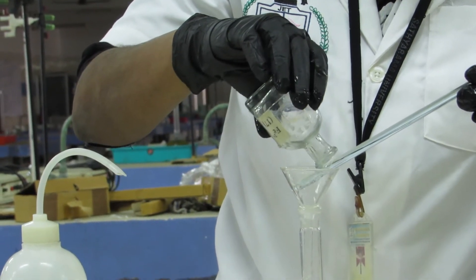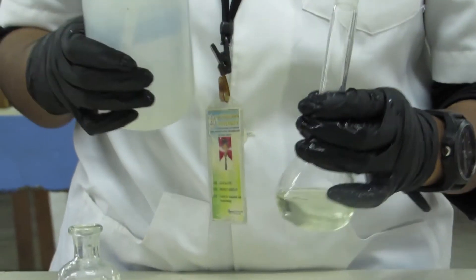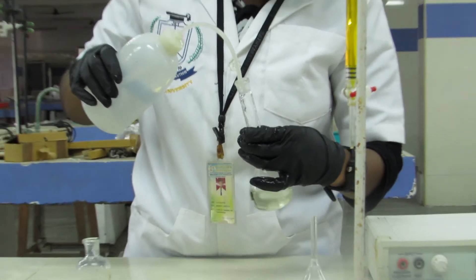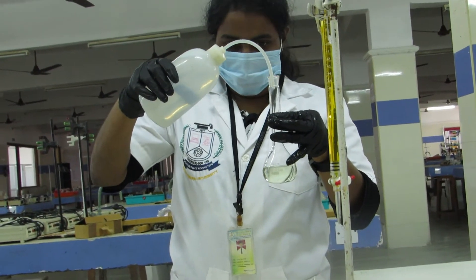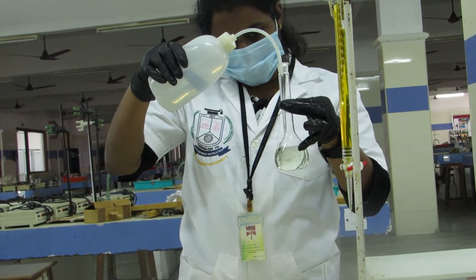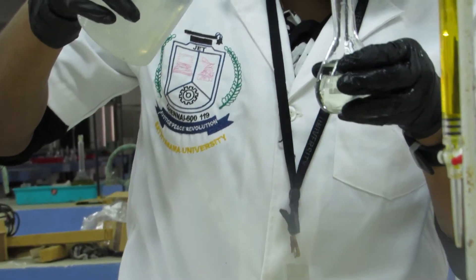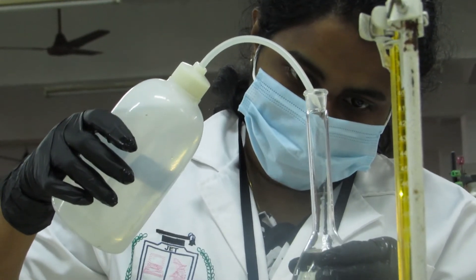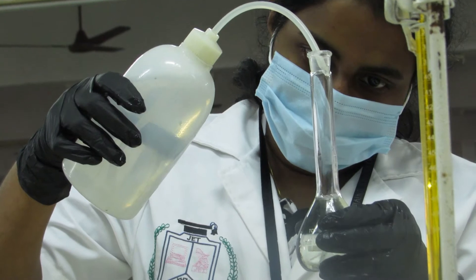We are transferring into the volumetric flask. After this, we are adding distilled water into the volumetric flask up to the mark. Up to the mark, we are adding.